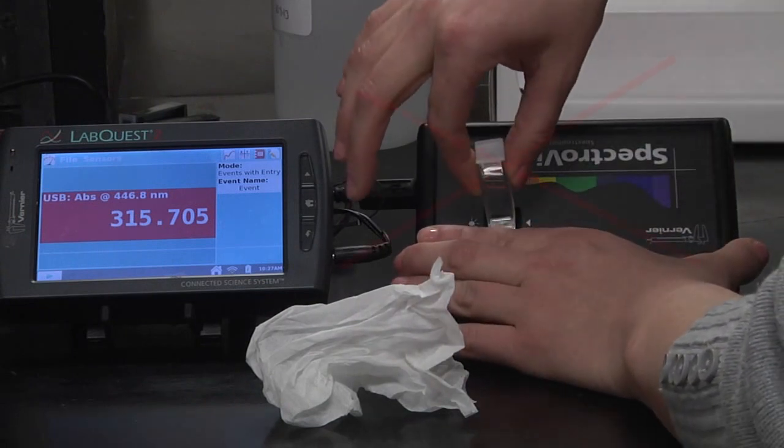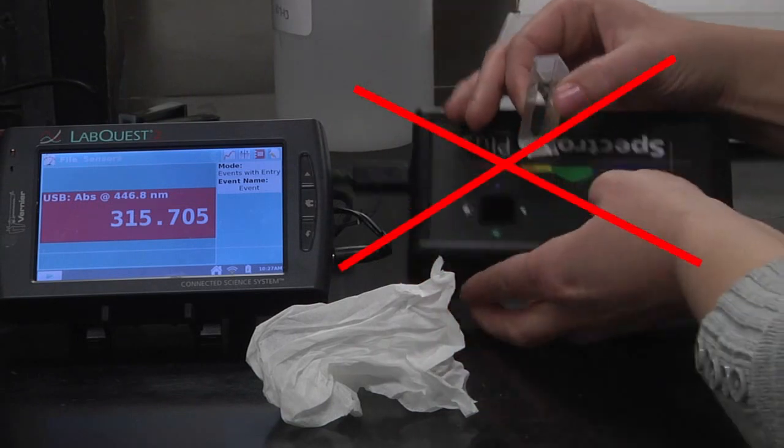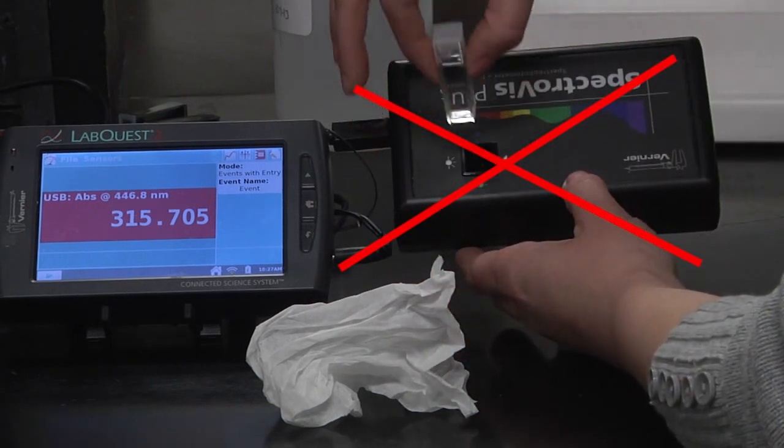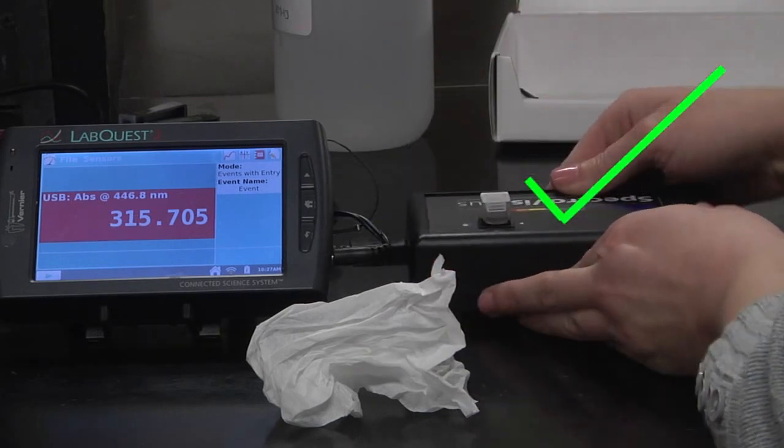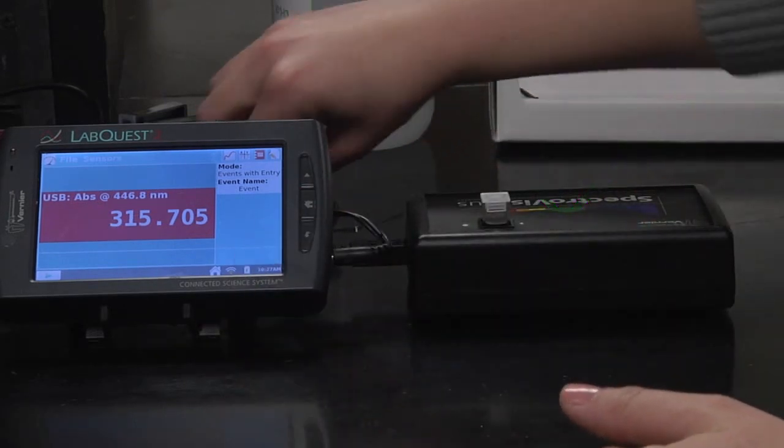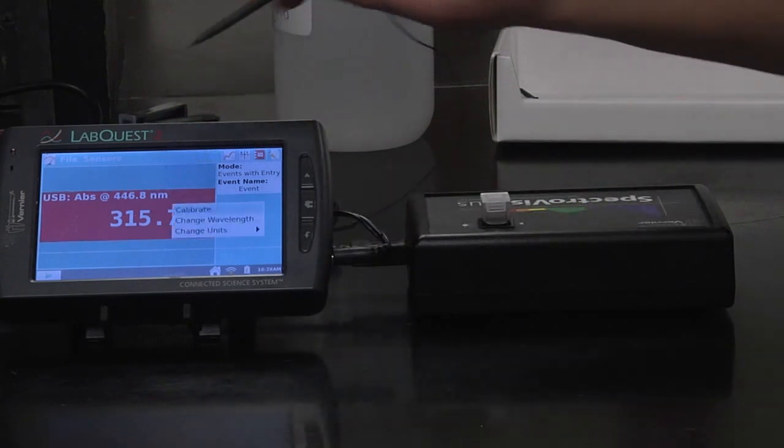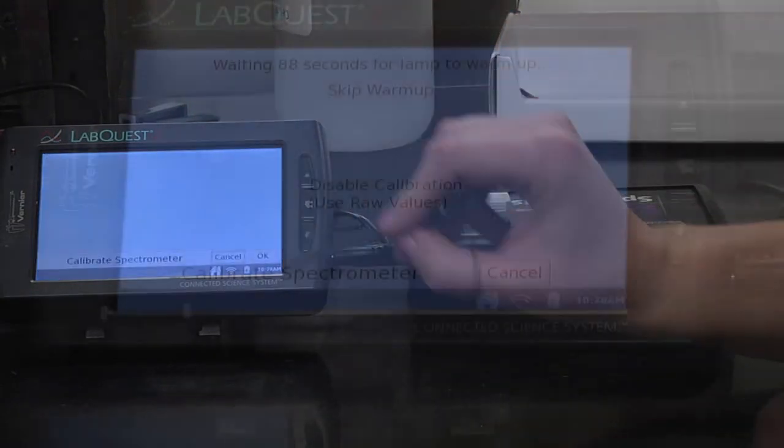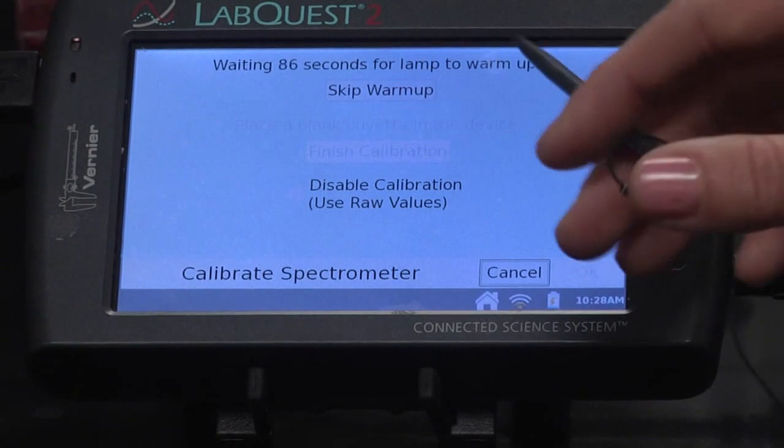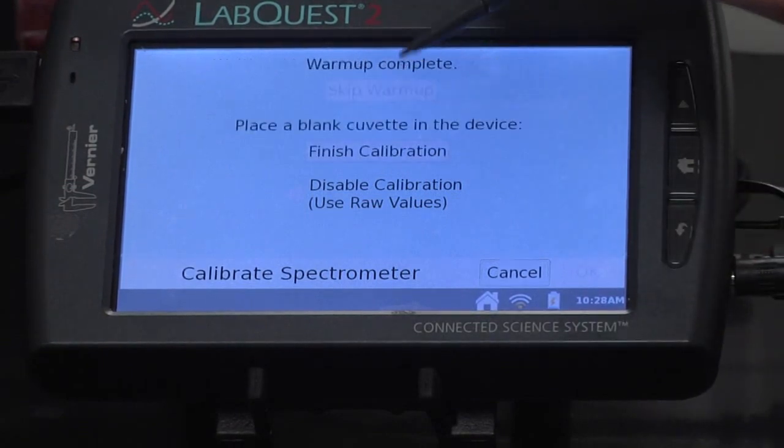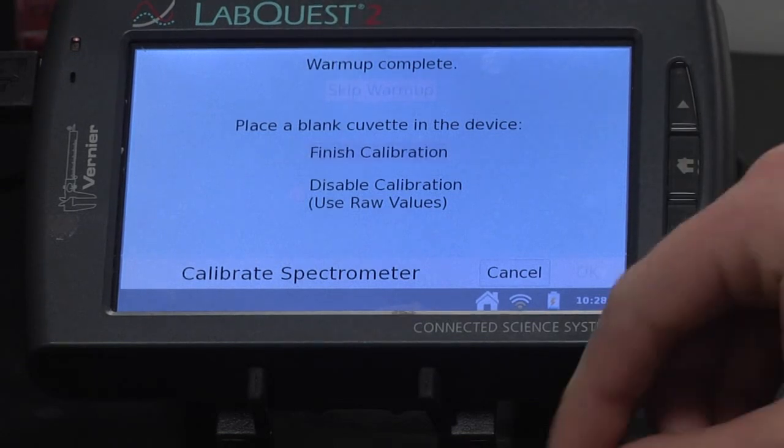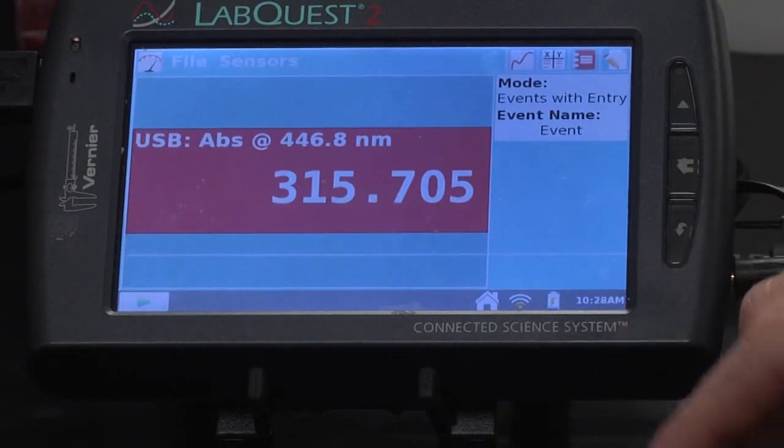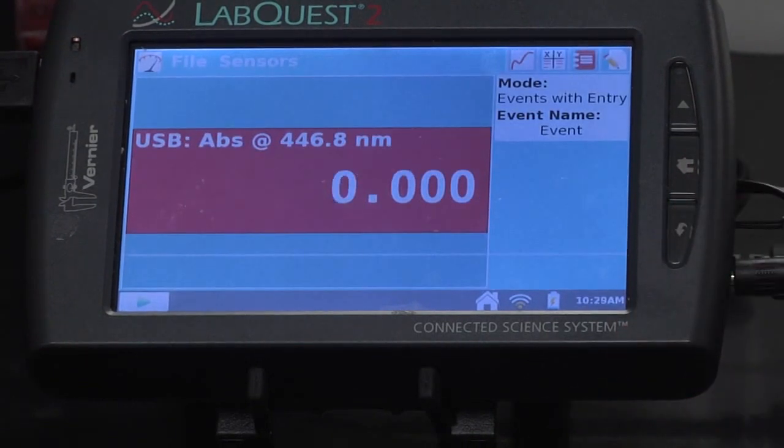Now you're going to want to tap the red screen and then click calibrate. It says to warm up, but I'm already warm. Place a blank cuvette in the device. Already did that. Finish calibration. If the solution is clear, then there should be zero light absorbed.